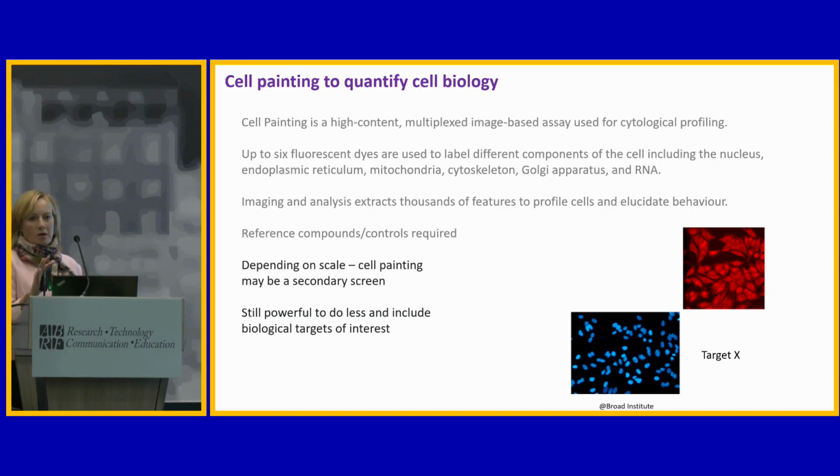Phalloidin discriminates biology beautifully, and what I'm a big advocate for is adding in your target X, staining for something else that's relevant to your biology, so that it may be coupled with the alterations in cell machinery, but it's very specific to the question that you're asking.